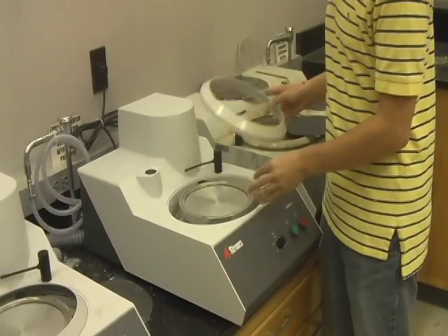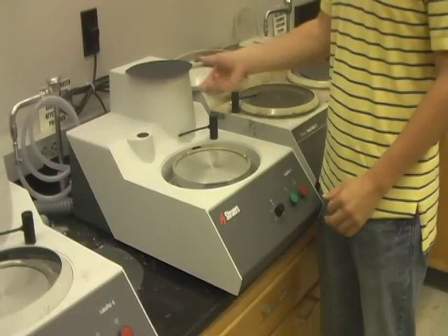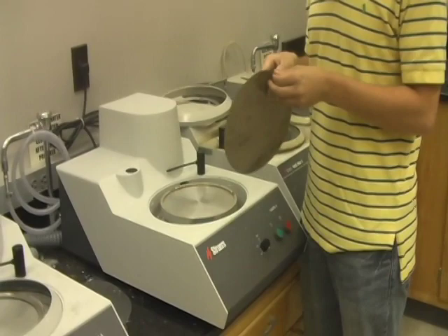First, we'll take the plastic protective ring off of the grinder. Then, we'll take the metal holding ring off of the turntable. You just put your finger in there and it'll pop right on. Next, find the appropriate grinding pad, which is normally starting with the roughest grit, which is usually the lowest number.